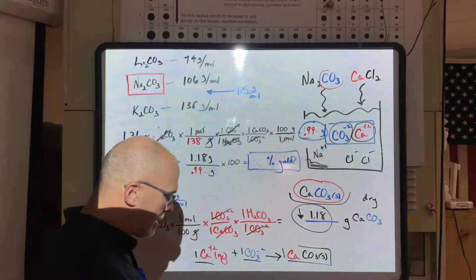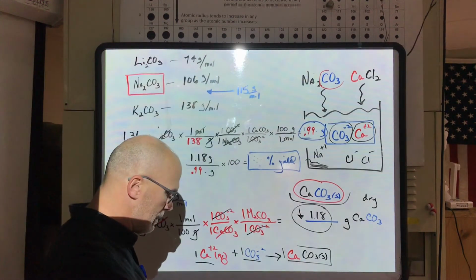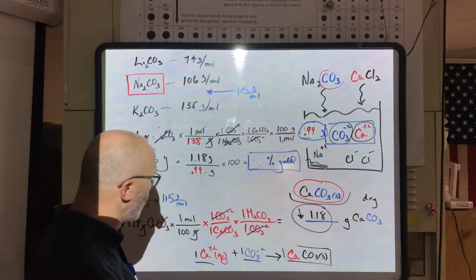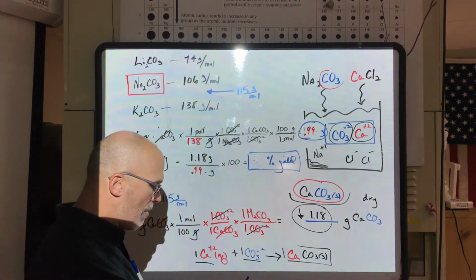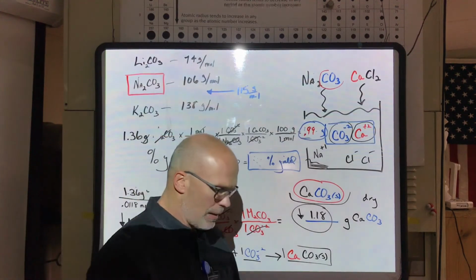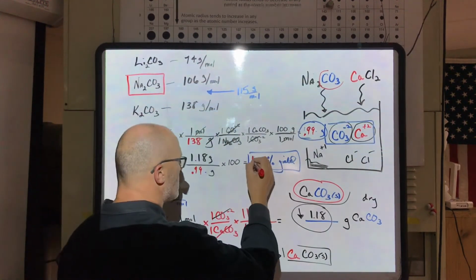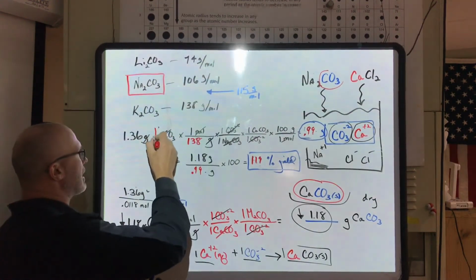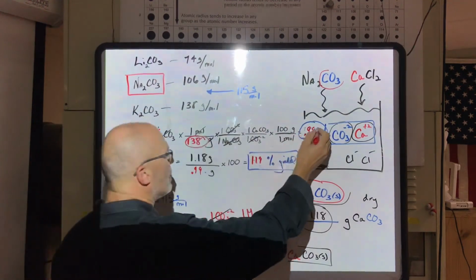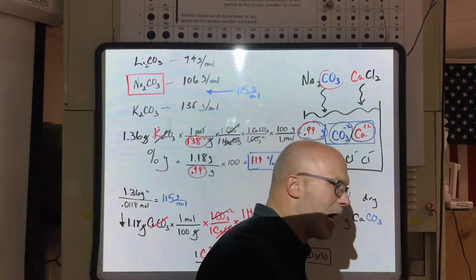So if you got your compound with a percent yield that's way above 100, okay, it's hard for me to support through your analysis that you have the right chemical. Divide by 0.99, okay? And I get approximately 119% yield if we change this to K, okay, and change those values. So that does not support.